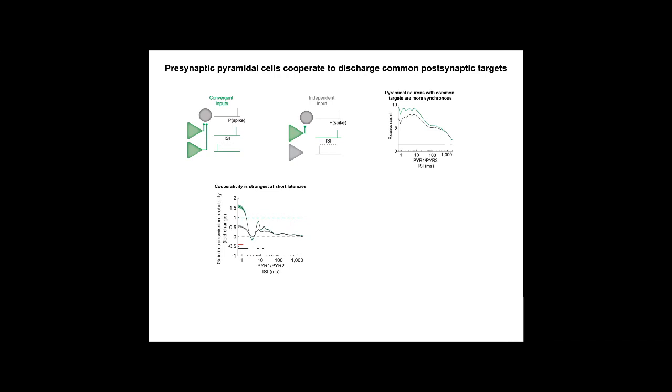Again, this is all spontaneous data recorded from a freely behaving mouse, and sometimes they're sleeping, sometimes they're doing stuff. We wanted to know, is this an artifact? Is this actually physiology of the circuit that we're observing? Or does it have to do with a network mechanism or a behavior or sensory input or something else that's creating this effect? And so again, we turn to the optogenetics, which is why these probes are so great.